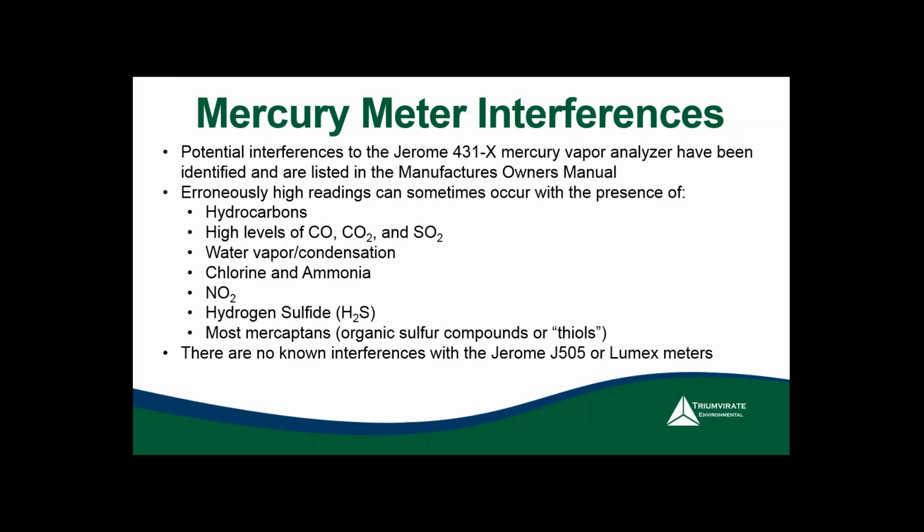Erroneously high readings can sometimes occur with the presence of hydrocarbons, high levels of carbon monoxide, carbon dioxide, sulfur dioxide, water vapor condensation, chlorine and ammonia, nitrogen dioxide, hydrogen sulfide, and mercaptans.